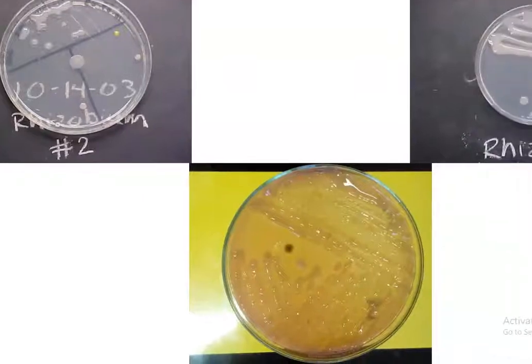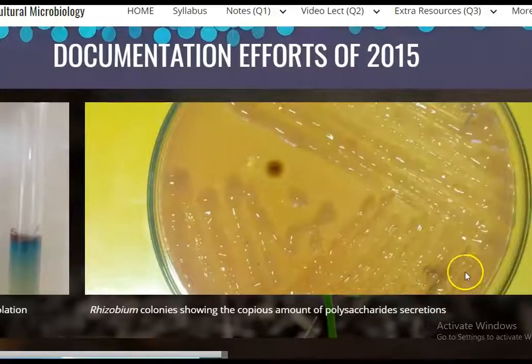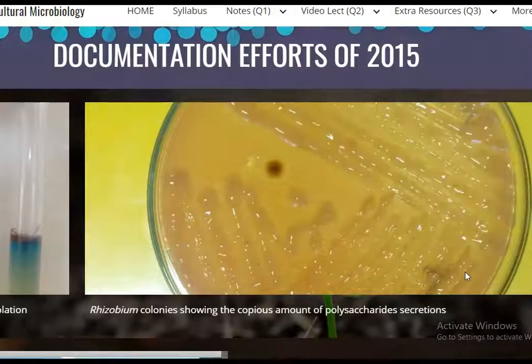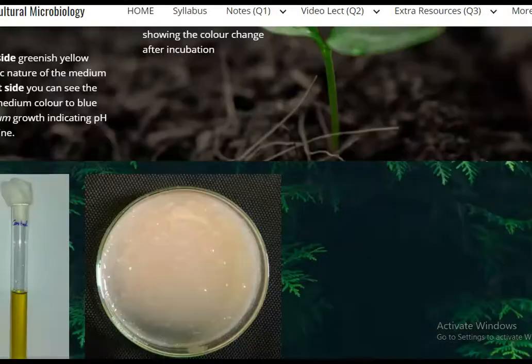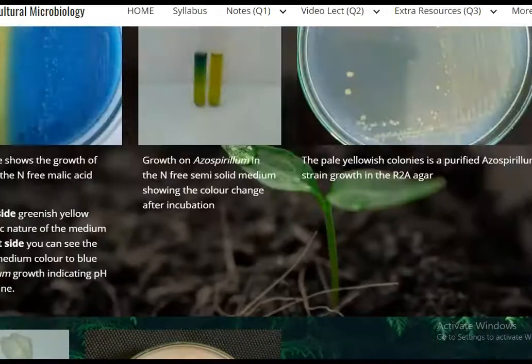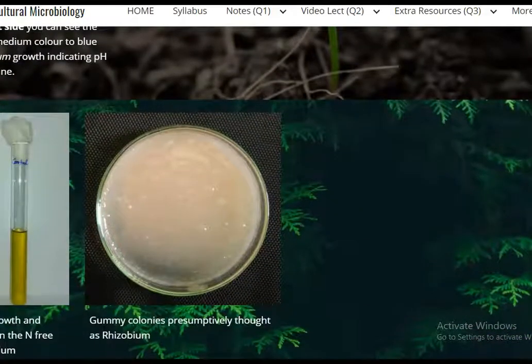Rhizobium colonies appear with copious gummy secretions. We will now look at documentation efforts by previous batch students. From the 2015 batch, you can see large amounts of gummy secretions in the petri plate. The 2016 batch also shows gummy secretions, though Congo Red was not added — they may have subcultured in a different medium such as R2A.